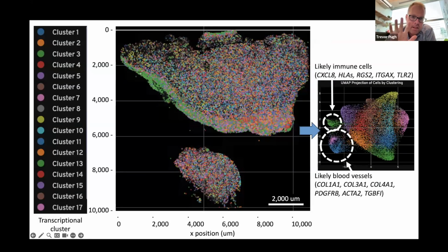So same sort of data, keeping the spatial information the same, taking the RNA sequencing data and then treating it as if it was a droplet-based experiment and generating a UMAP. So we kind of threw out the spatial for this first look.